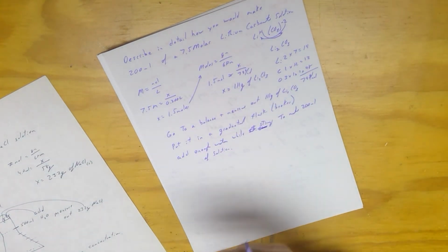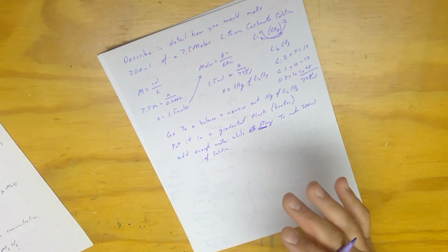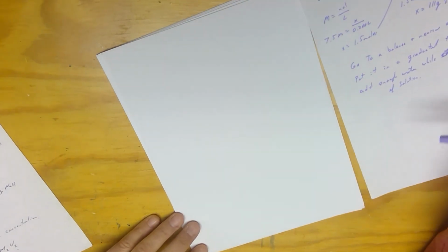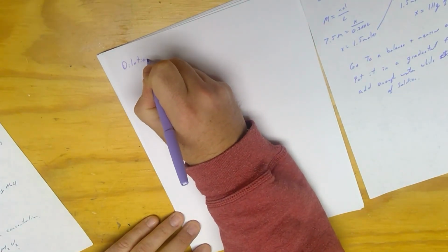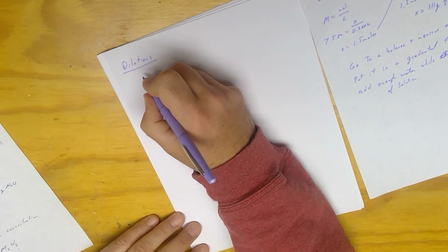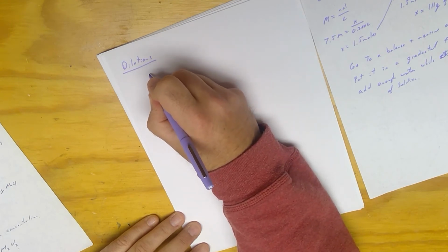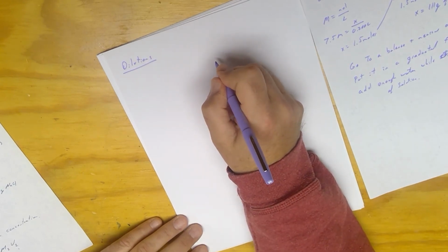Well, what if we already have a solution and it's too concentrated? In other words, we got to dilute it down. So this is called dilutions. What we do, we're going to basically water down a concentrated solution.